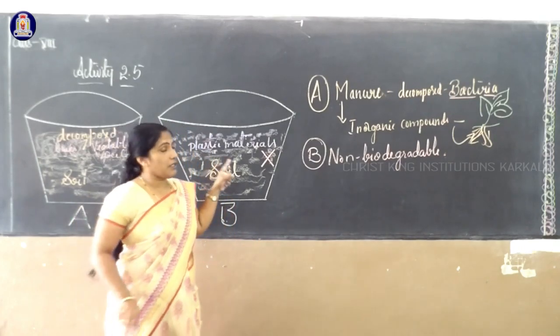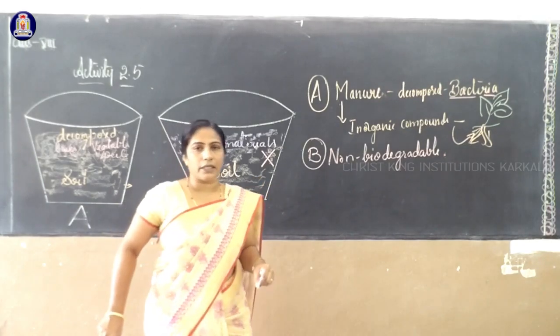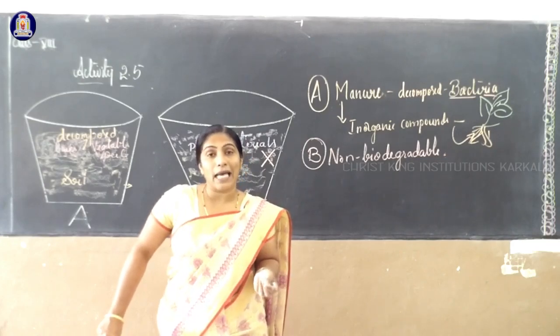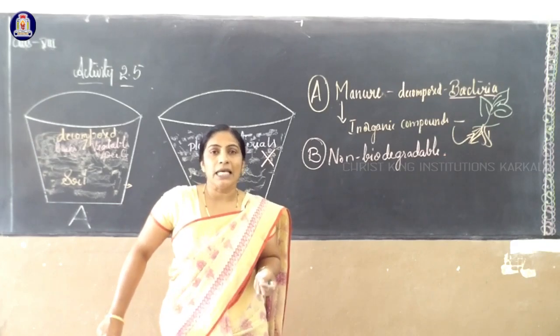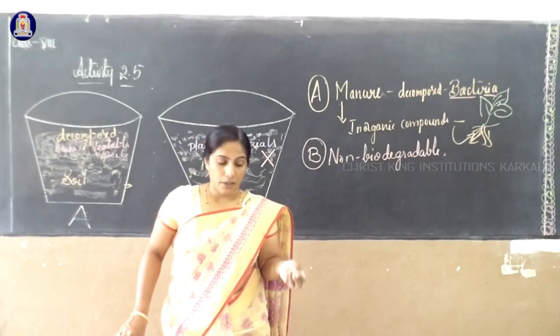The second activity is given according to the yeast cell as a microorganism. Already we have conducted the experiment. After 3 or 6 hours, especially after 6 hours, what will happen? Will any fermentation take place? What is the result? Let us see. Now I'll explain the result, then I'll show the observation of that experiment.